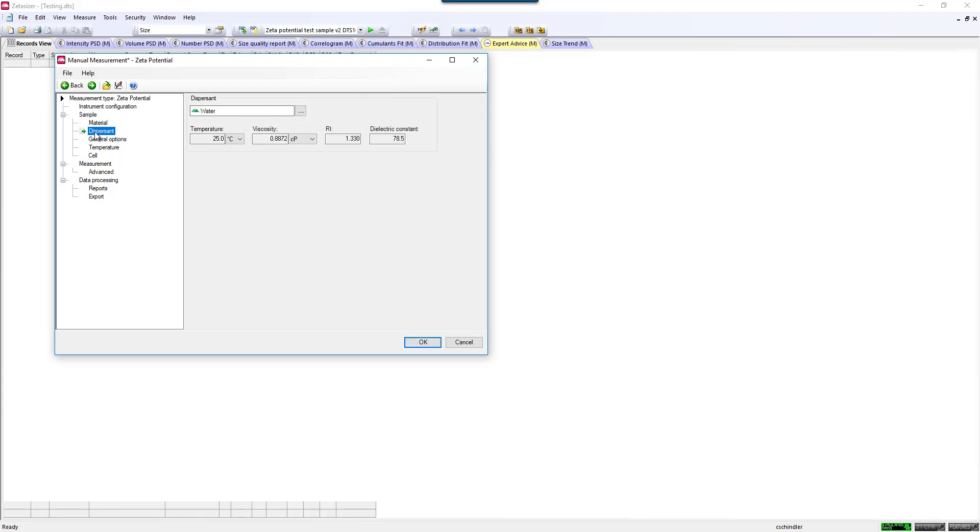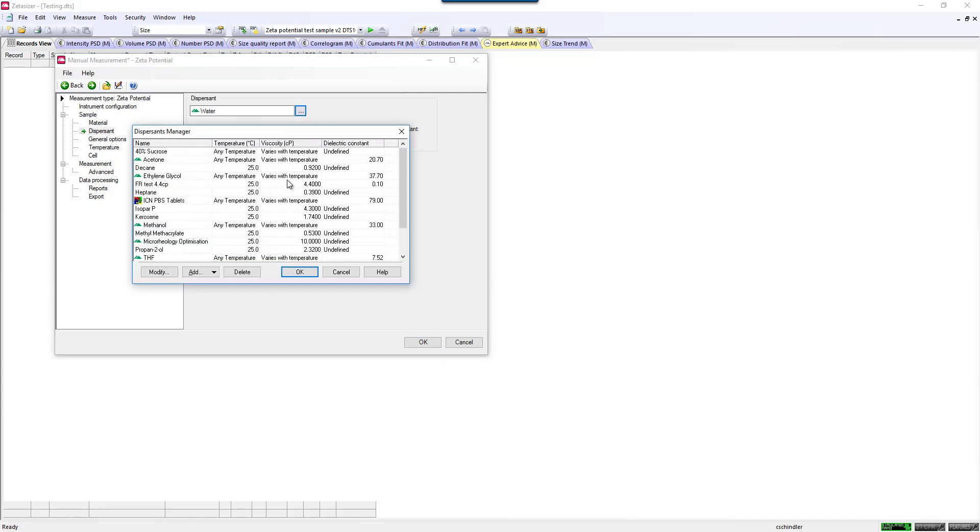The next setting is Dispersant. This is more critical of a parameter. You need to know the Dispersant's, or sample's, viscosity, refractive index, and the dielectric constant, which is important for Zeta Potential analysis. There is also a library here with different buffers and solvents, and if you need to enter your own, you can add that as well.